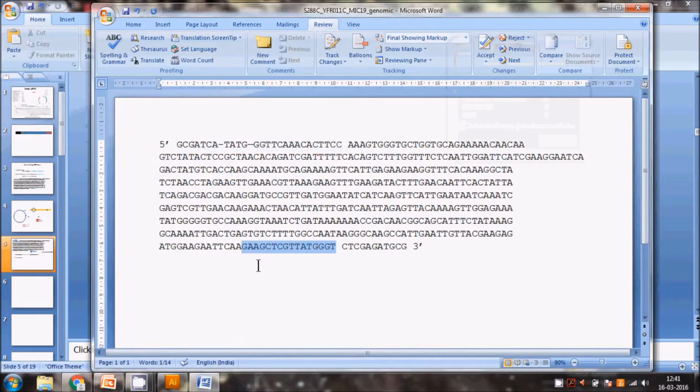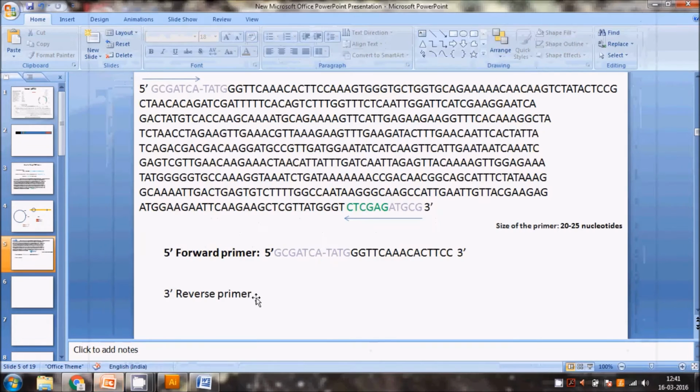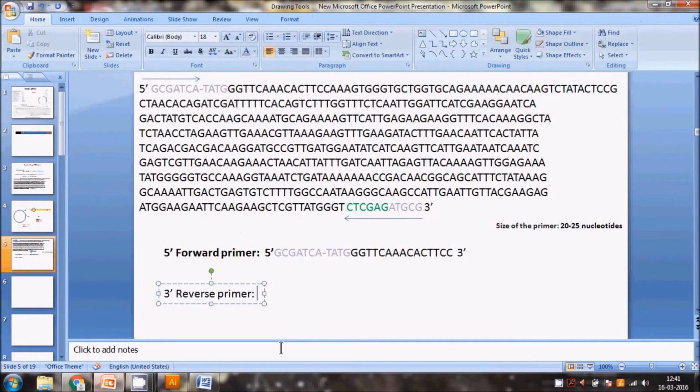This is good actually. So we will just take it and we will add it here for the reverse primer.